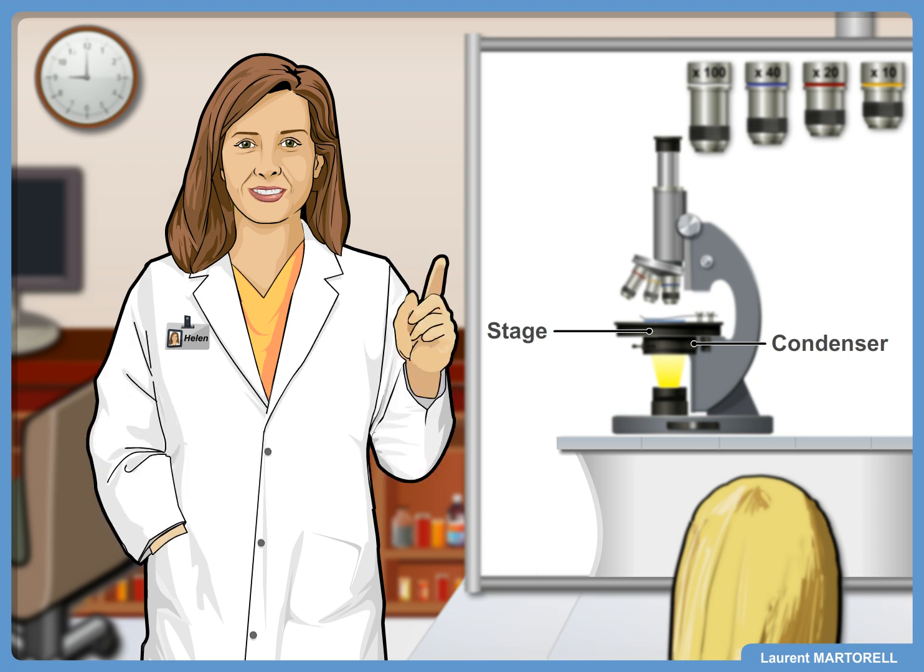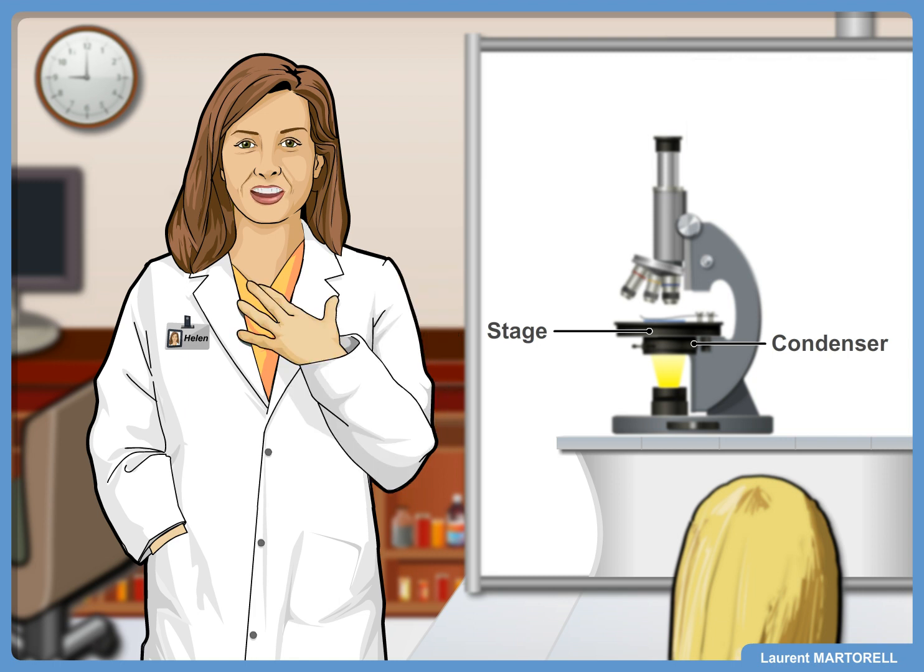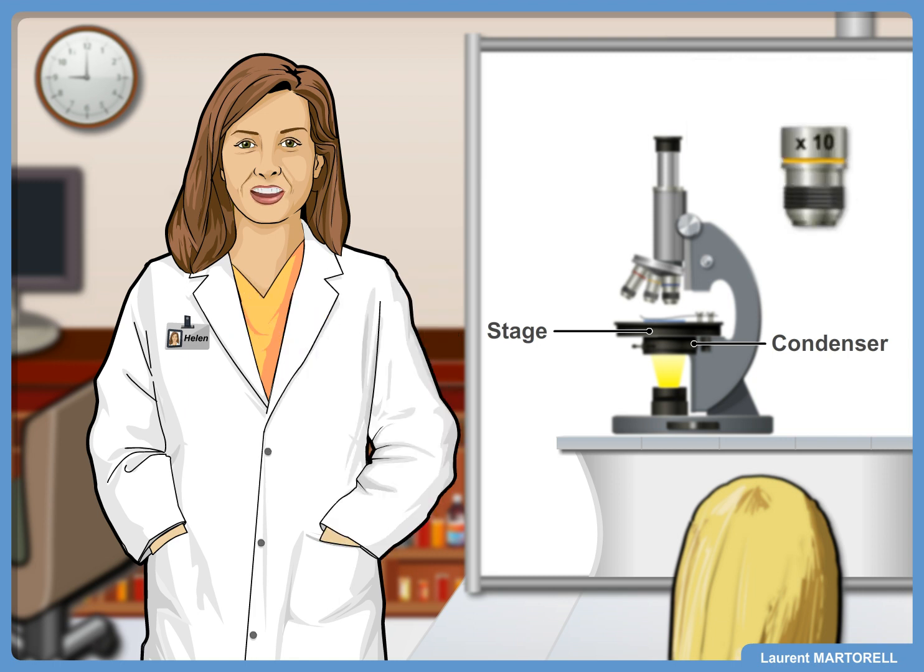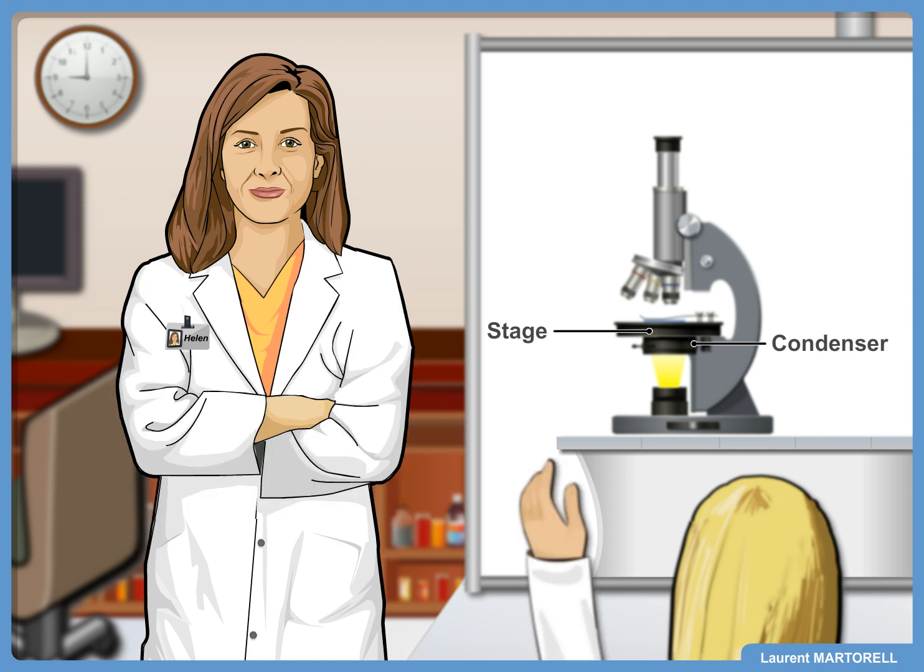For example, if you see the number 10 and the letter X written on the side of the objective, it means the object is magnified 10 times. How does it work? What is inside the objective to magnify the specimen? Inside each objective there is a lens. This lens corresponds to the magnifying unit of the objective.